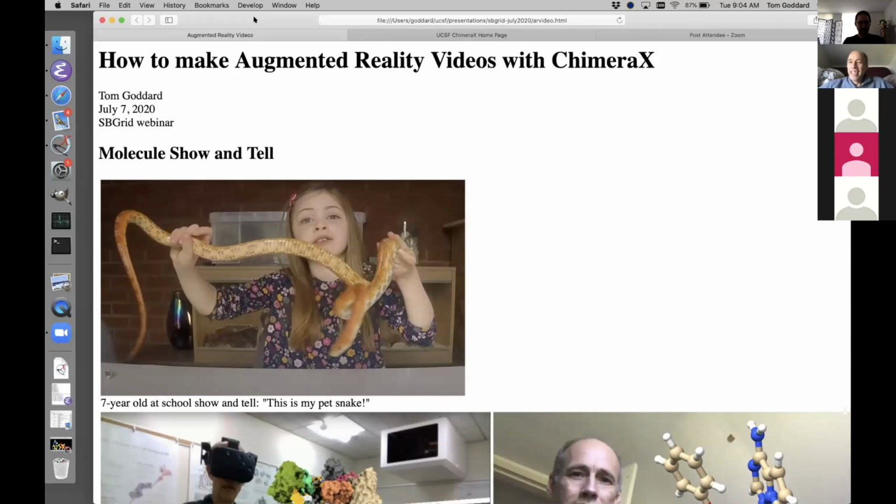Great, thanks, Pete. So today we're going to look at augmented reality in ChimeraX. We released our ChimeraX version 1.0 just a month ago. So if you're a Chimera user, you might want to give ChimeraX a try. It doesn't have all the features of Chimera yet. We're still working on moving some of the features of Chimera to ChimeraX. But ChimeraX has all the new cool stuff, and all our development effort has gone into ChimeraX the last few years. The only thing we do on Chimera is fix critical bugs. So at some point you'll want to move over.